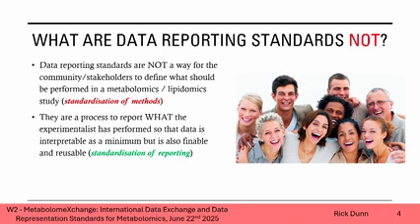And that's really important within the metabolomics community, lipidomics, etc., because we all have different assays. We all think we have the best assays. We don't all have the best assays. There's no perfect assay out there. But we're not trying to standardize how you do your studies and tell you how to do your studies. We're just trying to get you to tell us how you performed that study so that we can reuse that data appropriately.